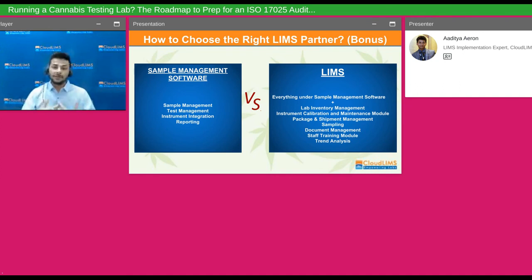Now, you've got enough information about the what, the why, and the how, and the process, and what's the life after accreditation. But if we talk about ground zero and what becomes your intangible investment in the longer run, and how do you make the correct choice for that? You have to understand the difference between a sample management software and a LIMS. A sample management software is mostly required to track all the sample information, all the test information only, and generate pertaining reports. But when you talk about a full-fledged LIMS, it can actually do much more.